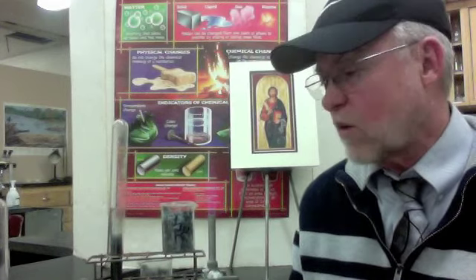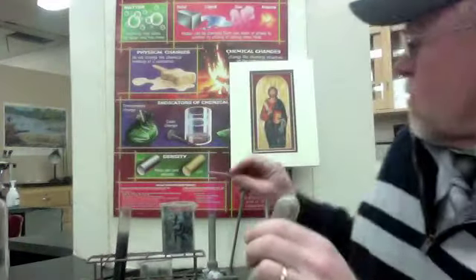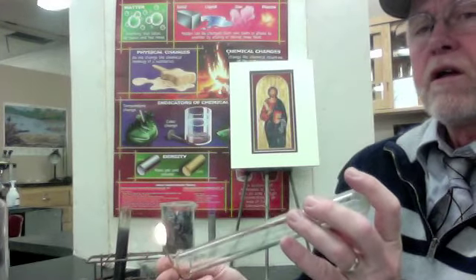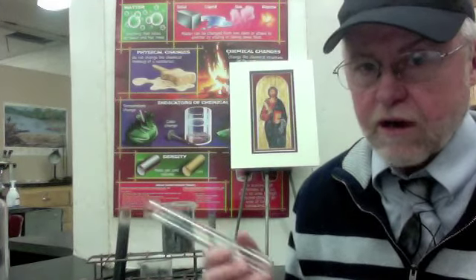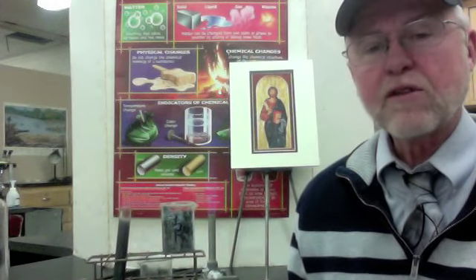Okay, so anyway, you could write the equation and balance it now pretty easily. But also you could write the equation for another reaction. This reaction when the hydrogen burns. Here we go. You could write the equation for that too. Hydrogen is combining with, well, you got to have oxygen to burn. Oxygen's in the air. Did it need activation energy? Yes, it did. And what do you think's produced when you burn hydrogen? Well, hydrogen oxide. You know the formula for that? Write the balanced chemical equation.